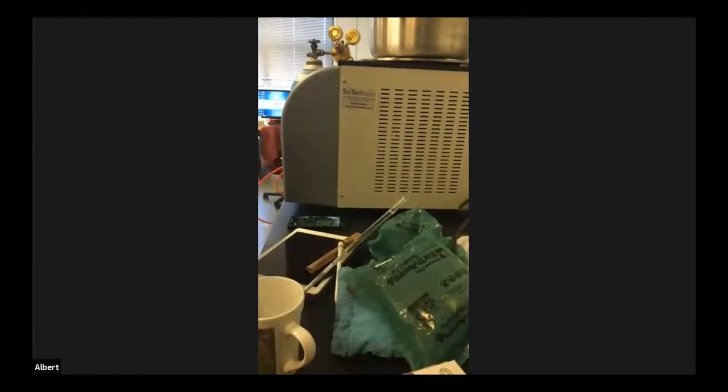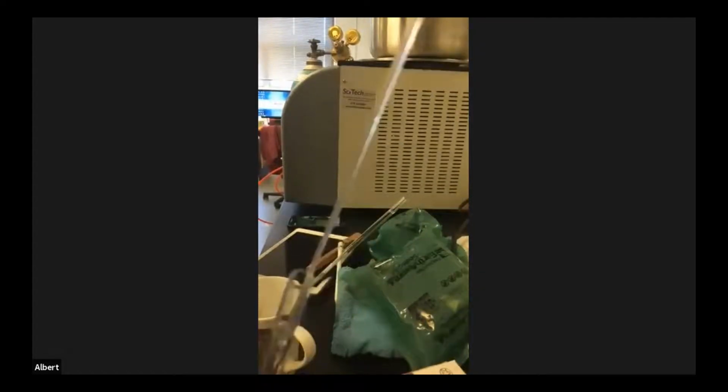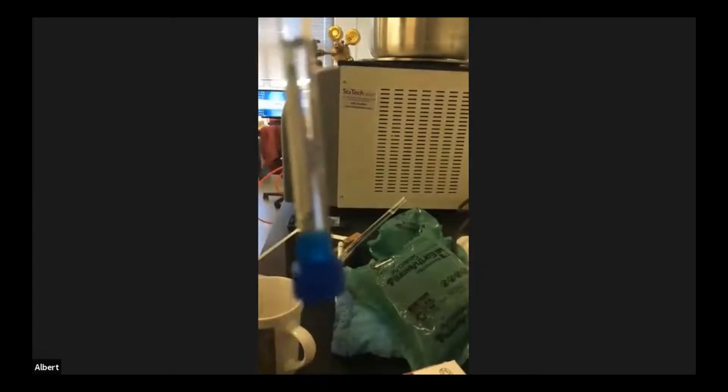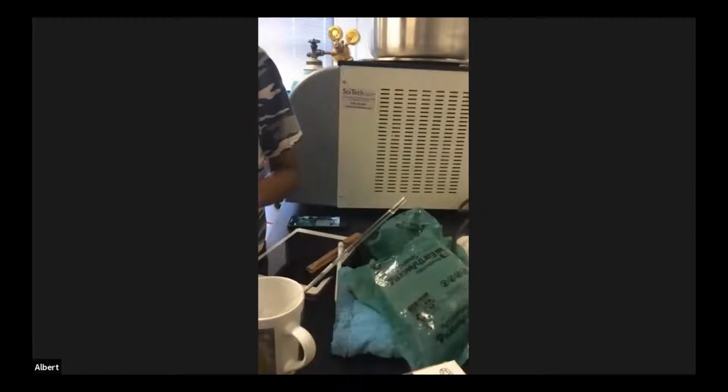I'm just going to take this, and I'm trying not to drip this solvent. This stuff is super expensive. And I'm going to add the solvent directly to that pipette. That's the purpose of using the pipette to transfer the solid. You can see now I have a sample that is ready to go into the NMR spectrometer. All right, add a little bit more and make sure everything dissolves up. This is standard. You normally do about 2 centimeters.